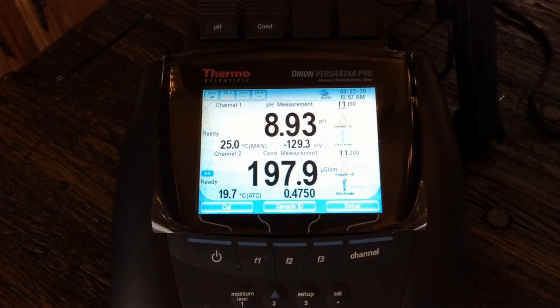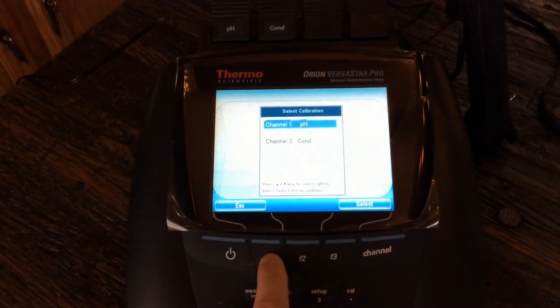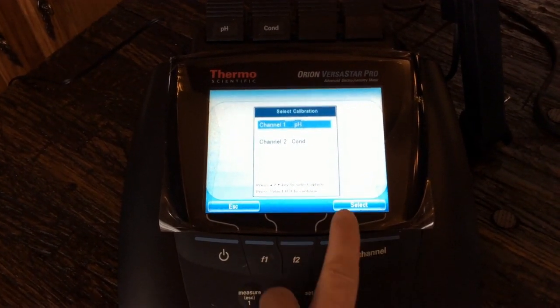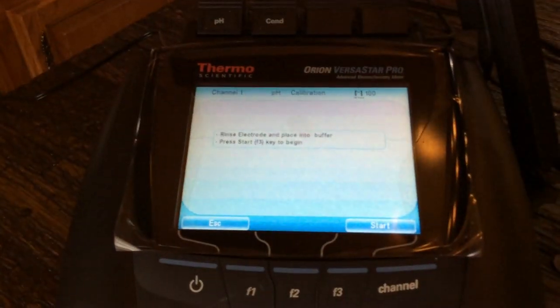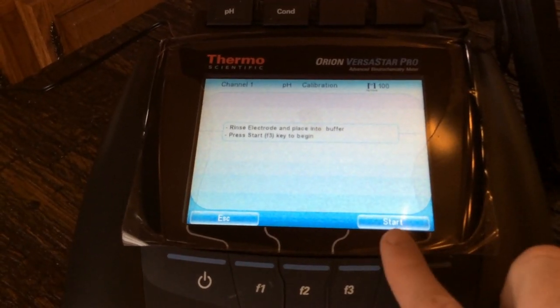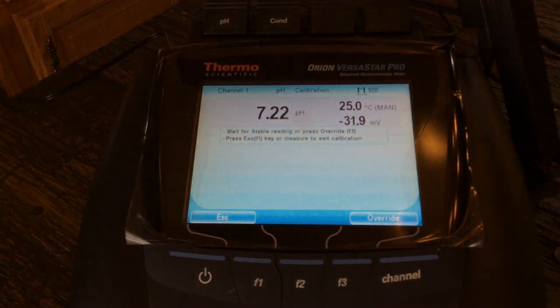If we want to calibrate one of our sensors, we use the function buttons. I'm going to hit F1 where it shows calibrate. It's going to ask me which one I want to select — it's on pH and that's what I'm going to do. So I've got select, I'm going to hit F3. Now it asks me to start the process. I've got it in my buffer. Once I have it in my buffer, it says press start to begin. We hit F3, and now the thing is going to stabilize and go through the calibration.